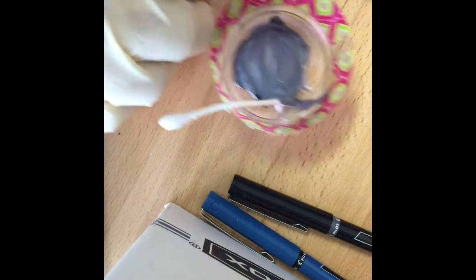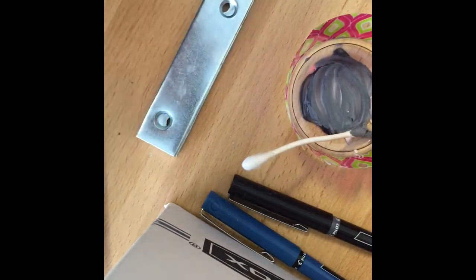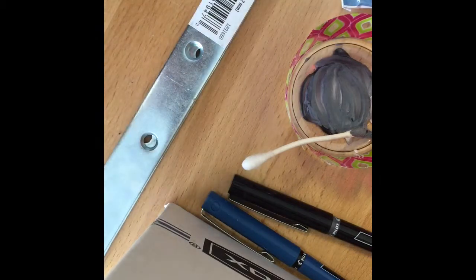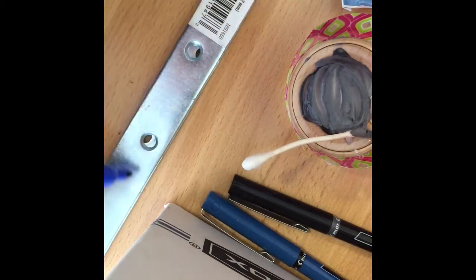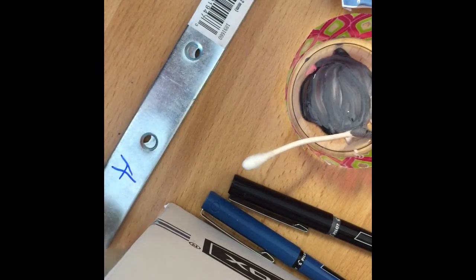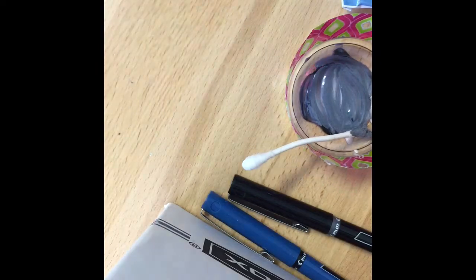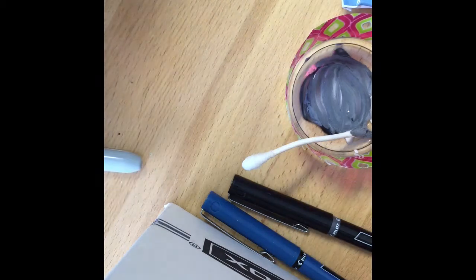So you notice it's not perfectly aligned, but it's nice and flat. I'm now gonna bring this into focus. We'll mark this A, and we'll do it over here too. So we're gonna set this aside.